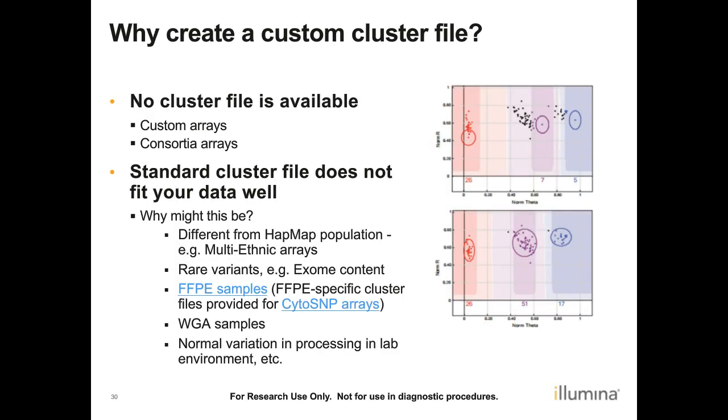So other reasons why you might want to create a custom cluster file? Well, for non-standard chips, for custom chips, chips that you've designed and asked us to create, we do not provide cluster files. Custom arrays and consortia arrays are not provided with cluster files. Clustering is left to the customer to do. Alternatively, you may want to create a custom cluster file if an existing cluster file that you've applied does not fit your data well.